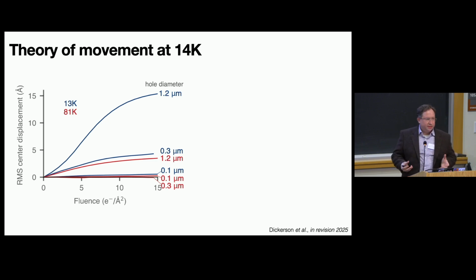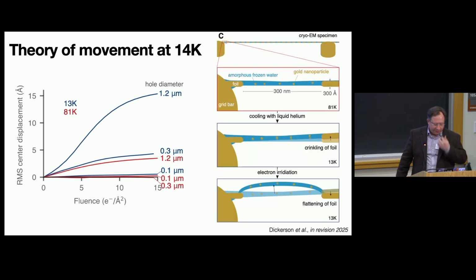So how do we put all this together into some proper understanding? Well, this is our theory of what's going on at helium temperatures. So in the top here, you can see your specimen support.